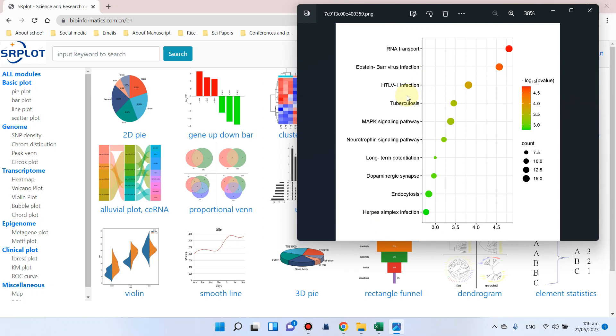Welcome to another video tutorial. In this video, I will tell you how we can make a graph of KEGG enrichment analysis. In this graph, you can see a beautiful KEGG pathway analysis, also called KEGG enrichment pathway analysis.